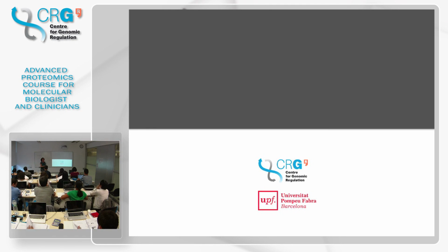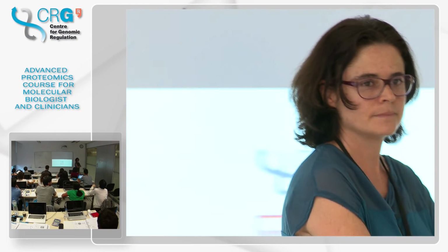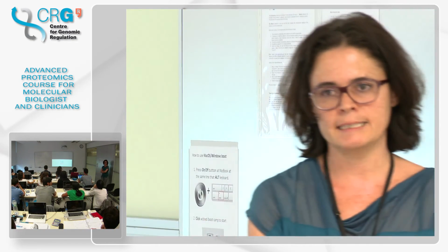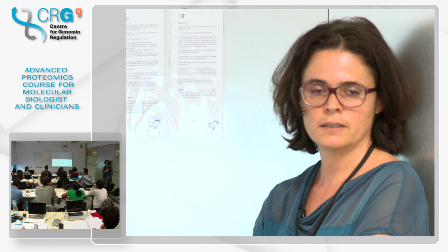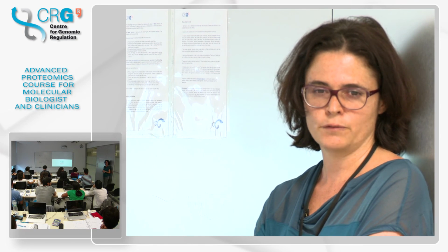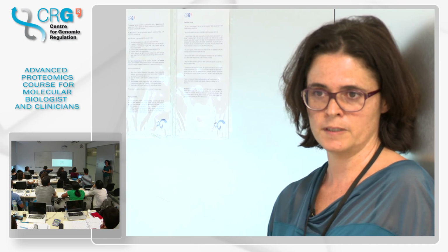Any questions? So how about these standards, I mean, do you always integrate some standard samples in your pipeline? Yes, we do. We always digest BSA. We use BSA a lot as control, in parallel with all our samples. And in case of complex samples, we use an E. coli extract, which is commercial.